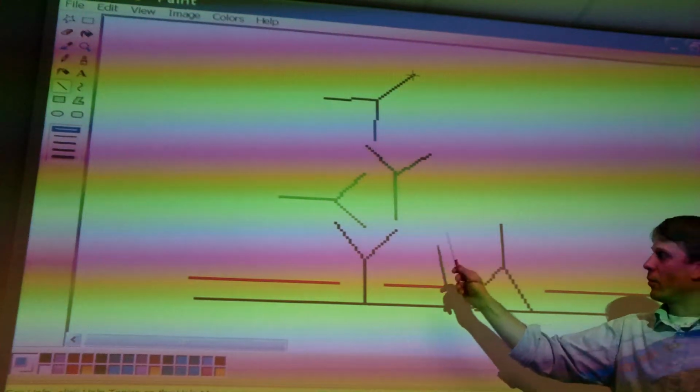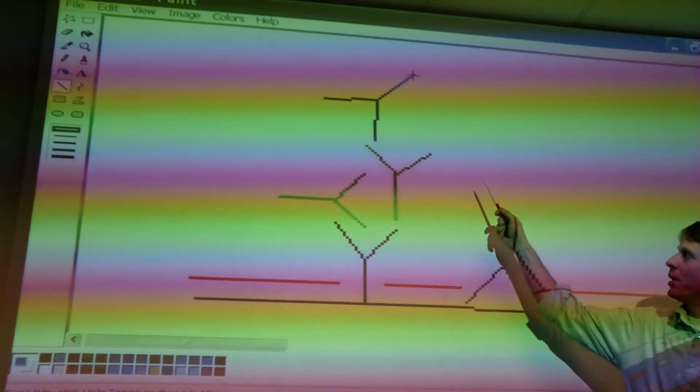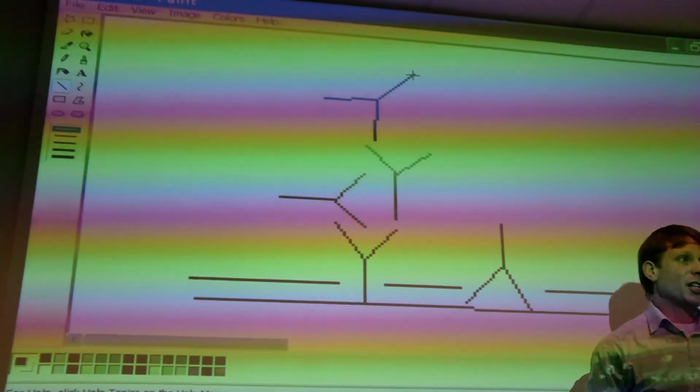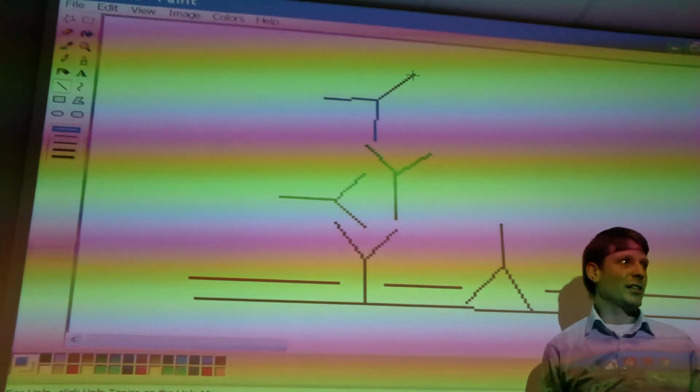Yes. You have to be careful that it doesn't bind here. I'm going to come to that in a moment. It can bind, it depends on the specificity. If we immunize the animal here with a heavy and light chain, it can bind also here to the Fab part of the antibody.